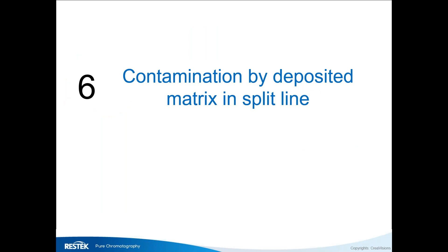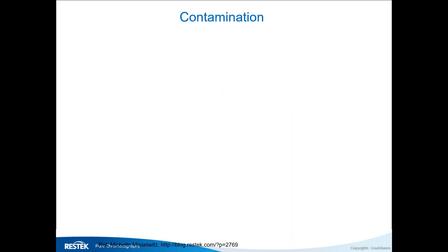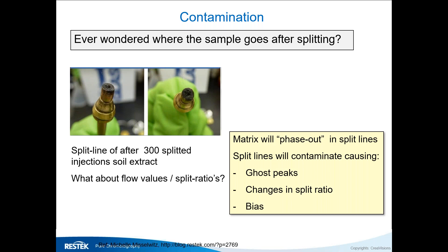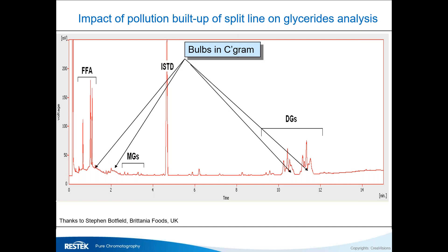Contamination can also build up in your split line. In a split injection, one part of the sample goes into the column — but the rest goes into the split line, which is not heated. If you run a sample with significant matrix, it will deposit in the split line. This can result in blockage, a change of split ratio, ghost peaks, and bias — all depending on how pure your samples are.